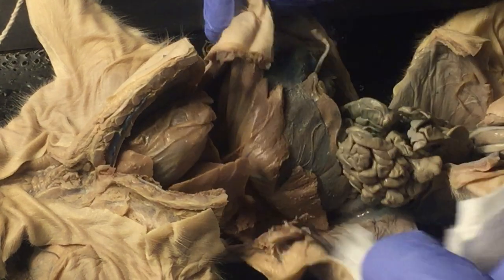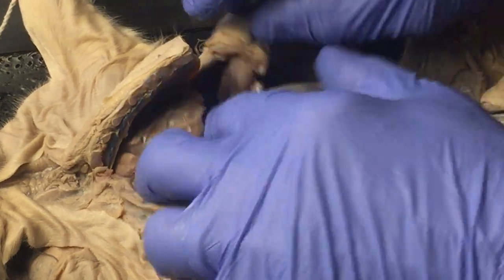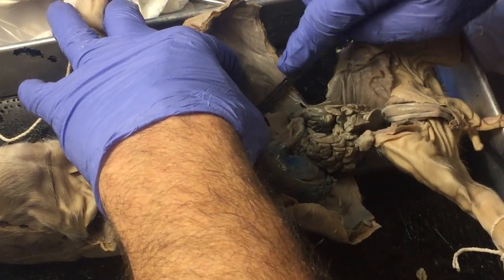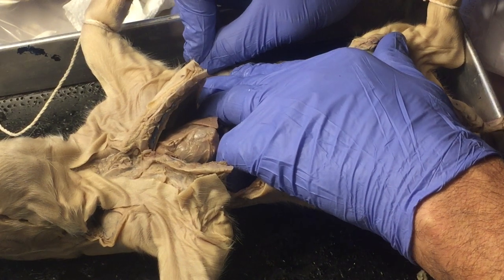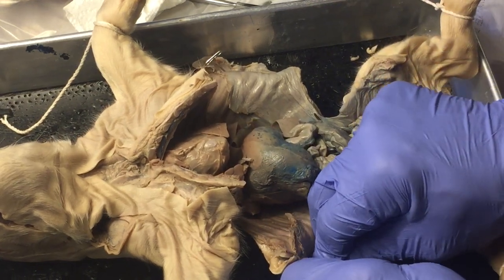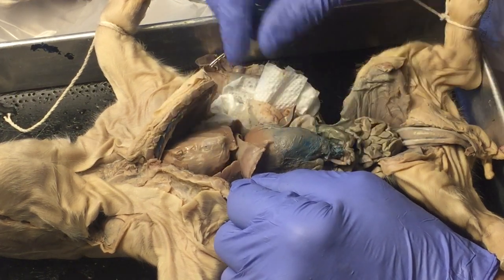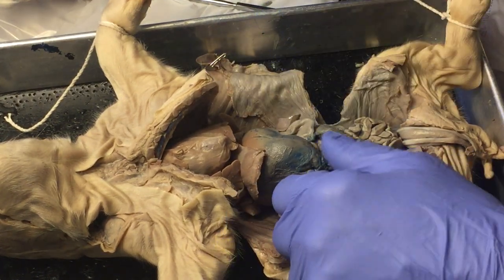I'm going to cut the diaphragm on the other side as well, then take some pins and open it up so you can see inside better. Here again is the diaphragm that separates the thoracic cavity from the abdominal cavity. I'm getting some of that extra moisture out of the way.